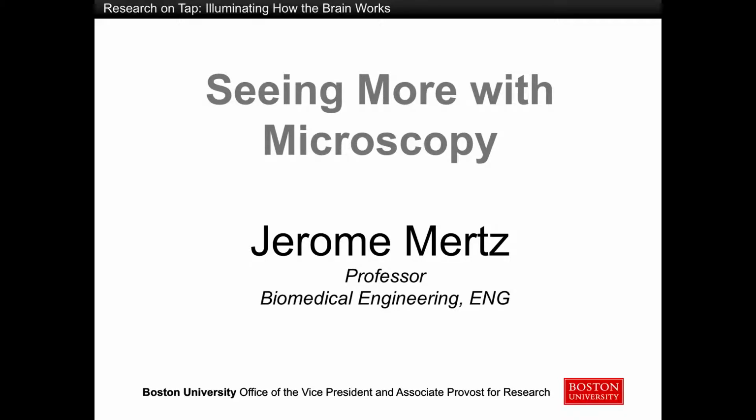All right, so my name is Jerome Mertz. I'm in the biomedical engineering department. What we do is we build microscopes. We develop microscopes for biologists. We try to tailor our microscopes to biologists' needs, and the problem with biologists is that they're very demanding.